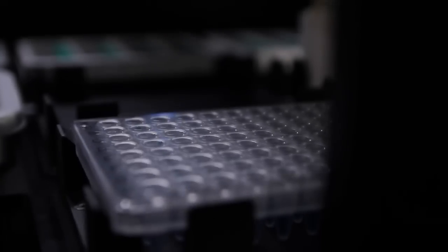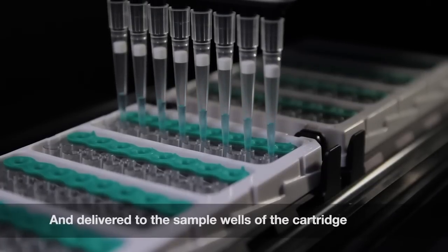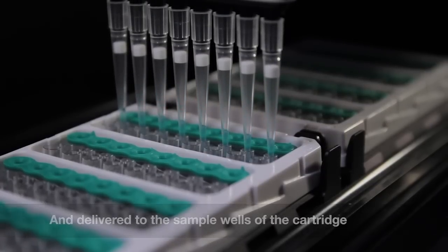The droplet generator head moves over each cartridge, adding droplet generation oil and generating droplets for eight samples at a time.